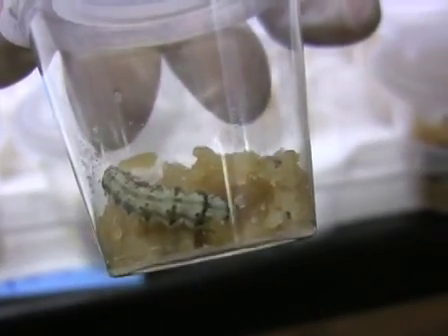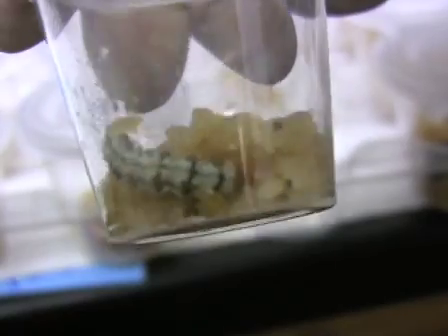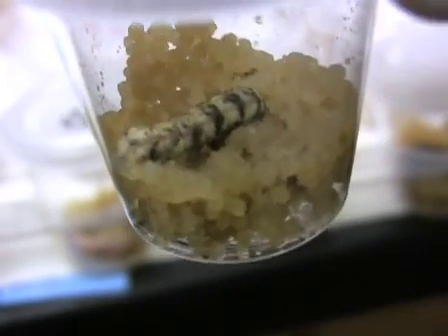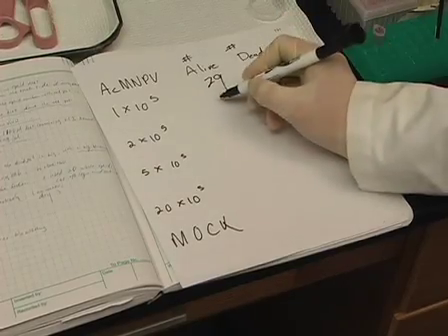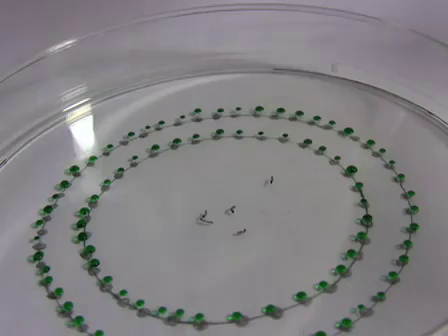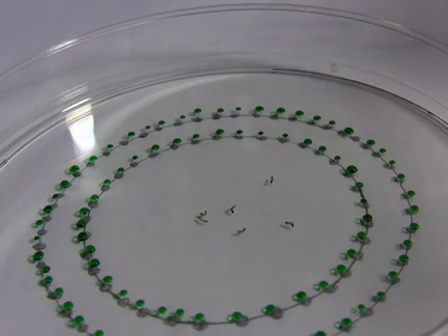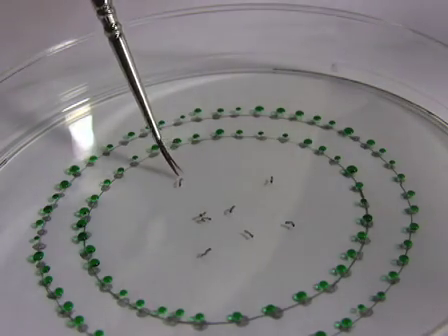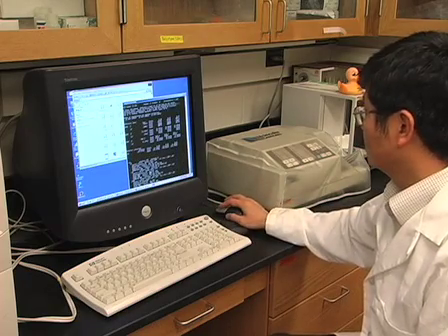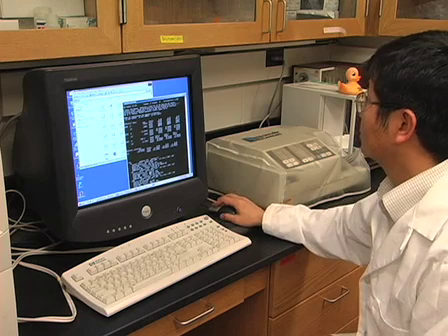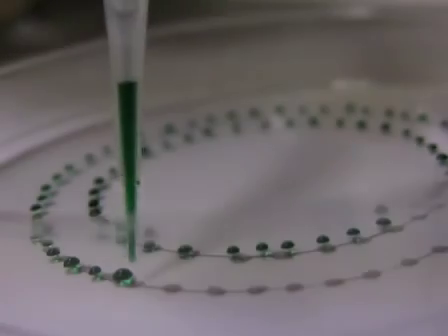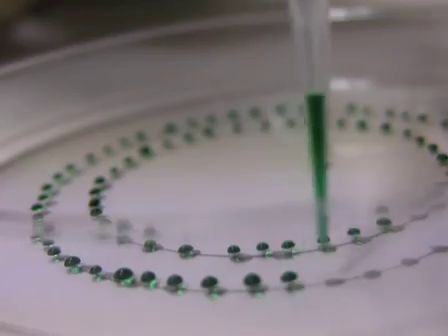Virus-infected larvae will remain on the top of the food and then die. After a few days, dead larvae will sometimes melanize and turn black. Larvae that die from infection essentially become bags of polyhedra, which will completely dissolve if mechanically disturbed. At this time, score the larval mortality in each treatment. Lethal concentration bioassays should be replicated 3 or 4 times on separate occasions, using 30 individuals per dose for each virus or control treatment. Use an appropriate probit analysis program such as POLO or SAS to calculate LC50 values, 95% confidence intervals, and the appropriate statistics.